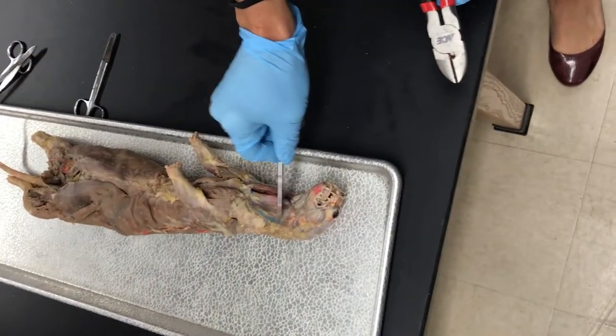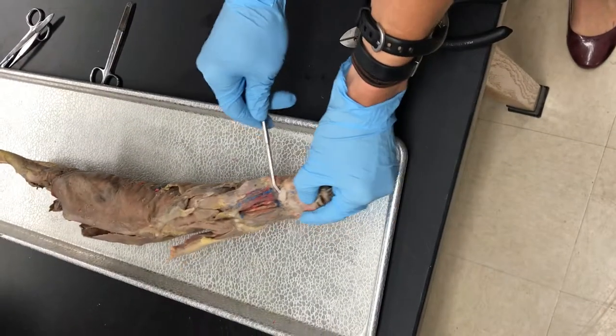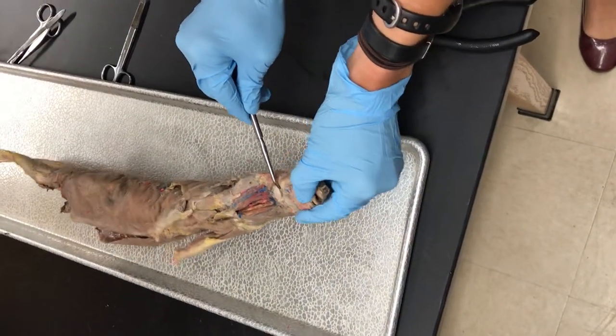Just looking at him, you can see one of those external jugular veins right here. There's a mandibular salivary gland - it's got a nice oval shape to it.